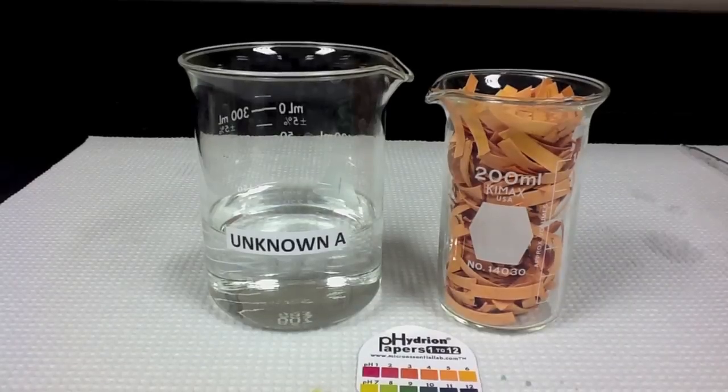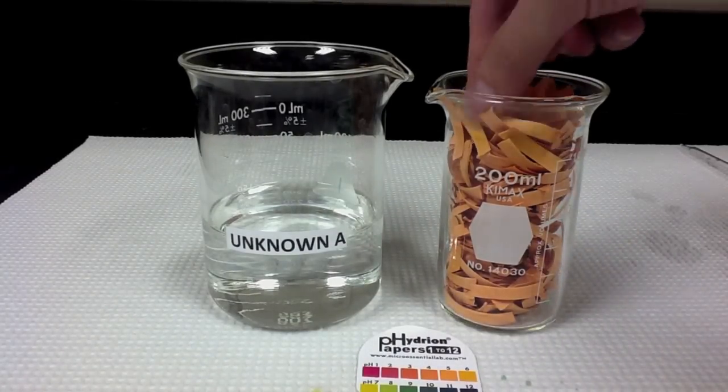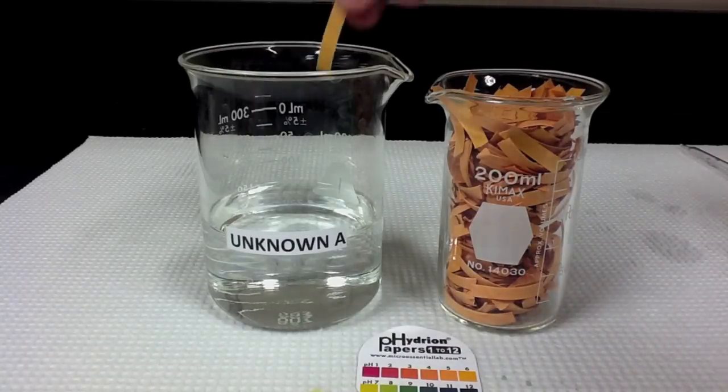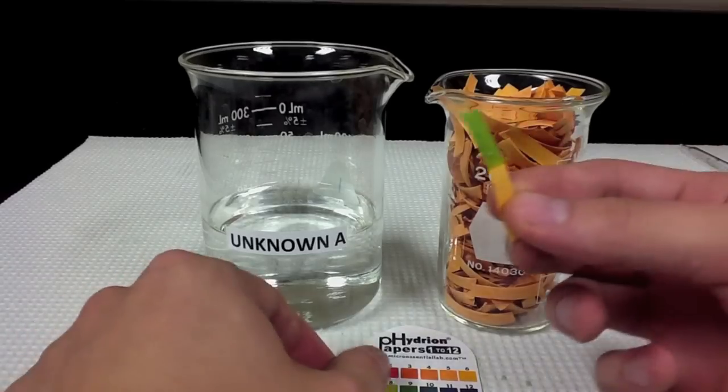pH paper works in a similar fashion to anthocyanins in that it uses a colorimetric scale to determine pH. Simply take a piece of the paper, dip it into the solution, and then compare the colorimetric result to the chart provided in your lab manual.